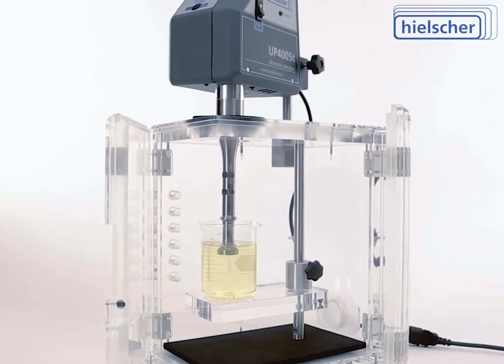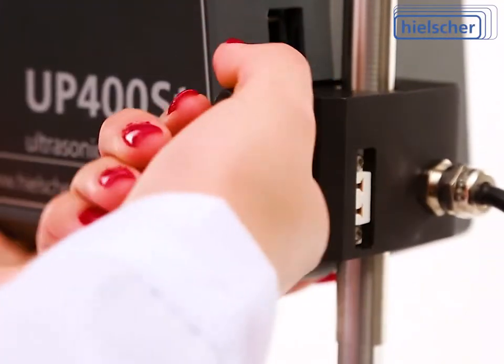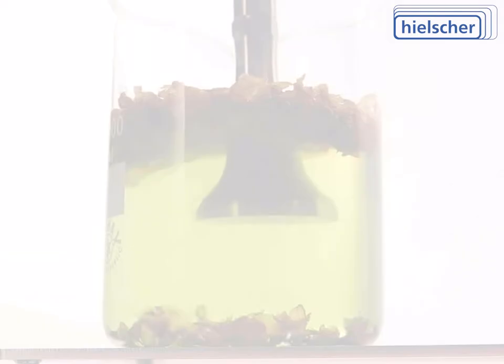Hielscher is an ISO certified manufacturer, and the UP400ST fulfills the CE standard and is UL, CSA, and RoHS compliant. The Hielscher UP400ST offers the best-in-class performance in the market.